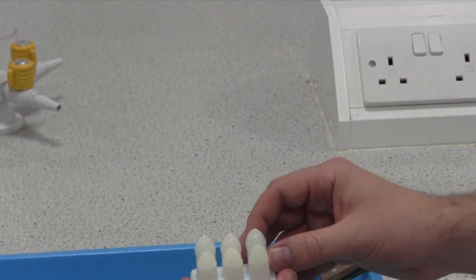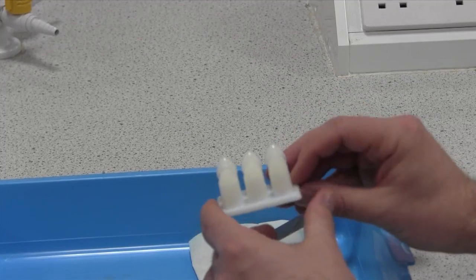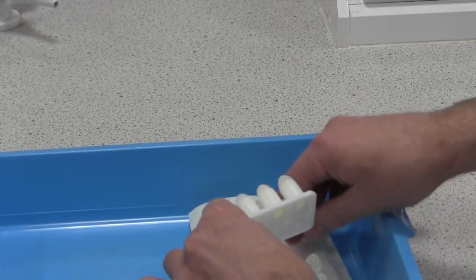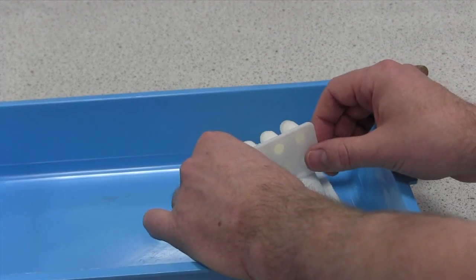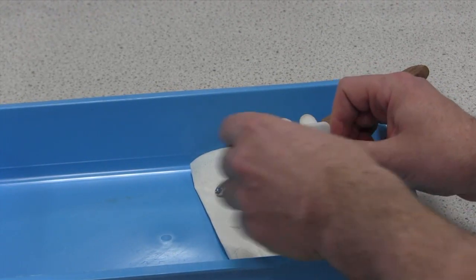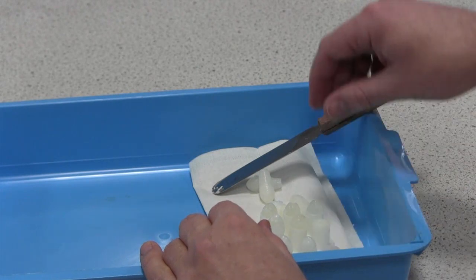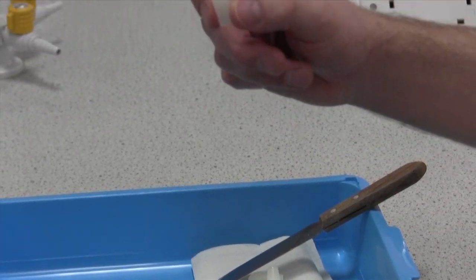It's normally easier if you remove the cap first and then press out the suppository. I normally say if you have a piece of paper or something below it so they don't fracture when you push them. Normally it's just literally pushing on the ends. Sometimes you'll need a bit of pressure and they will pop out. The end result is something like that — a classic bullet shape.